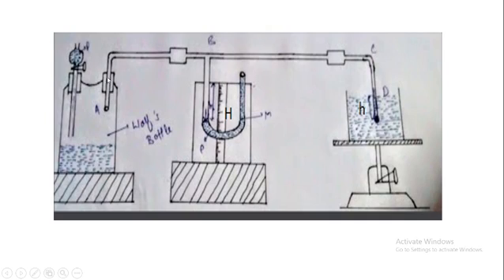That air will move through these pipes, so there is a pressure here. You can see your bubble is forced, so there is a pressure, and it will move the capillary liquid. When air is forced, you have to increase the force slowly by feeding water. Then a pressure will be created, and this pressure is a force on your liquid inside the tip, which moves in a downward direction.